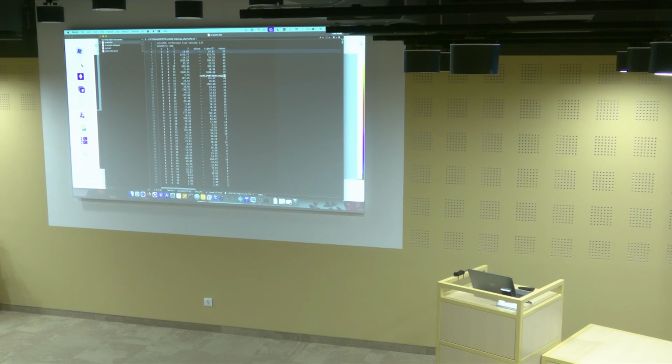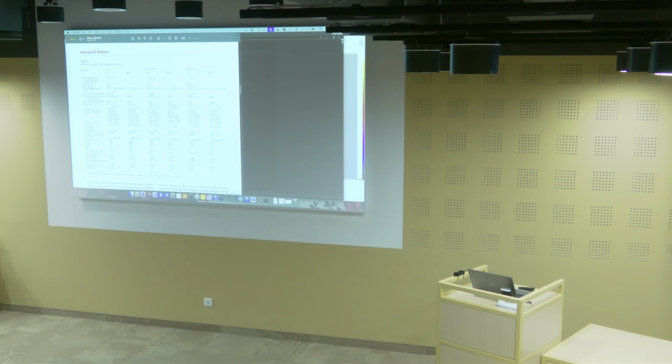So what we did here with only 1,300 images is not that great. If you go back to the publication that came with this, they processed 2 million images and had 200,000 indexed images. We're only working here with 1,300.